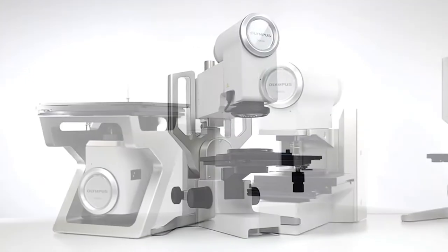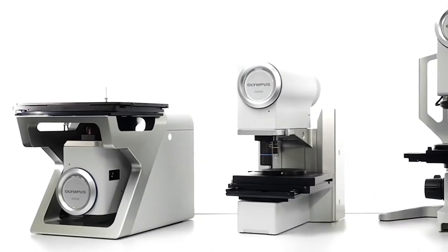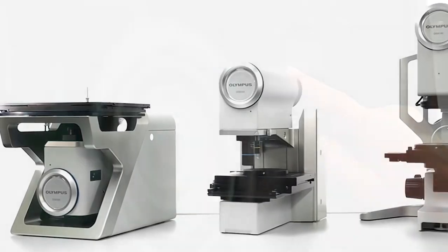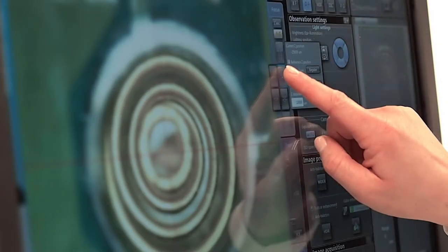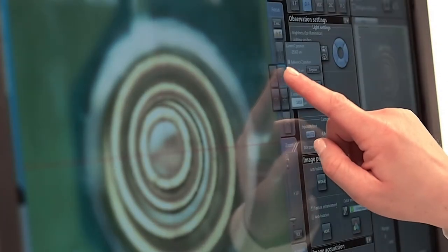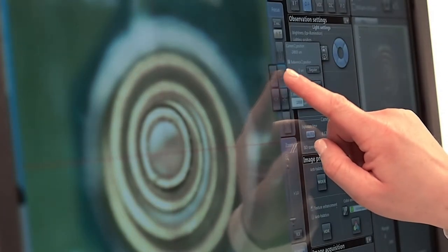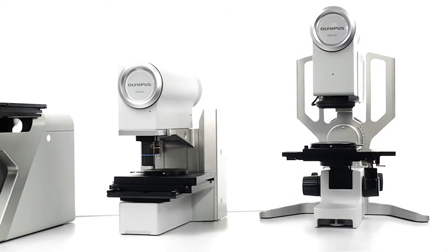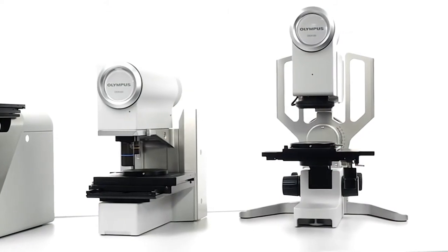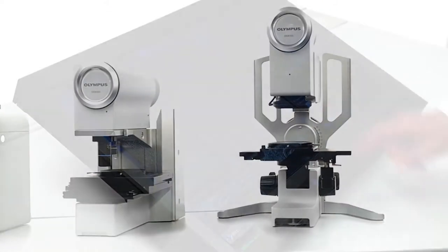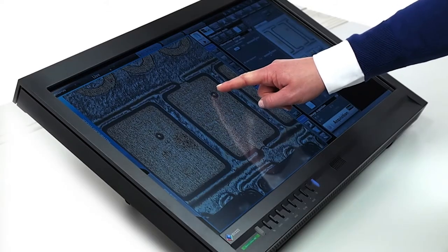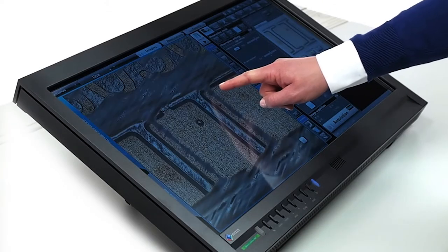The DSX series features touchscreen operation that makes it as easy to use as a smartphone or tablet computer. With digital technology, you are just a fingertip away from your sample.